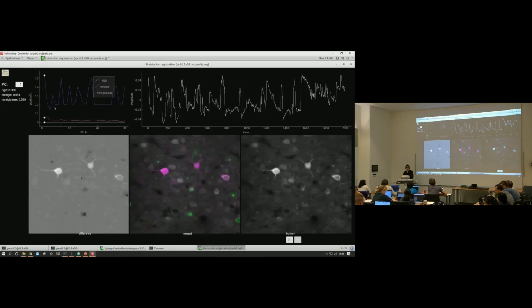That's the maximum. 0.5 is actually quite a lot, but it's only the maximum over the field of view. There's only one number, that's the shift. So there's the mean shift across the field of view, but we're doing this with non-rigid. Oh, okay, yeah, that's the non-rigid max, you're right, sorry, I have them wrong in my head. The rigid is this white line, which is at 0. Thank you, Marius.